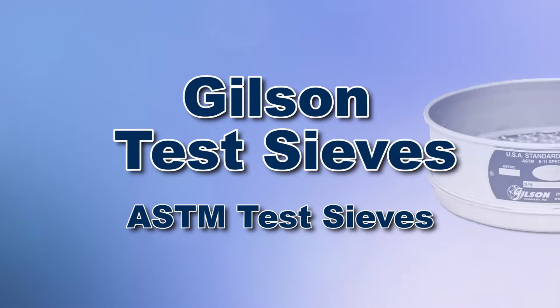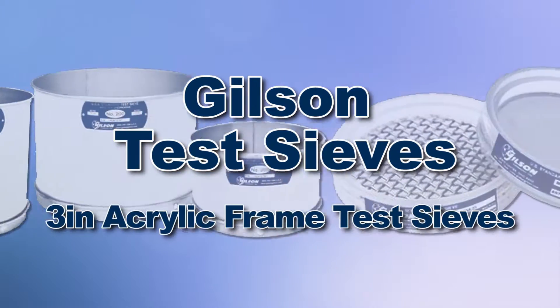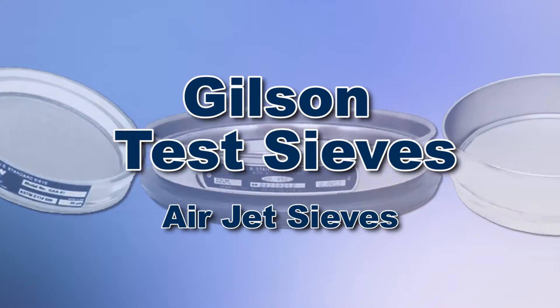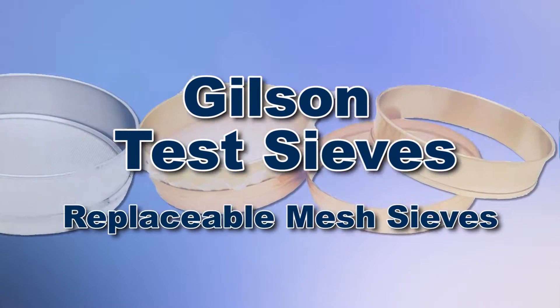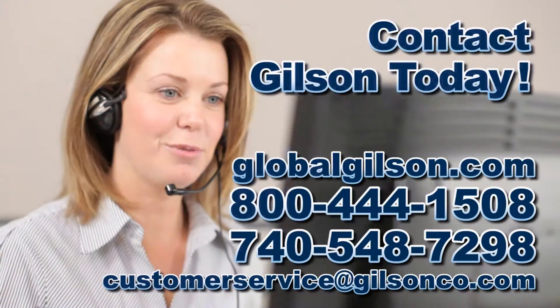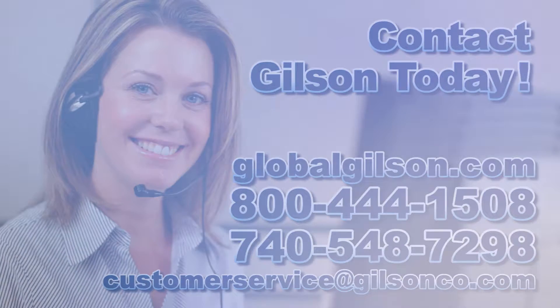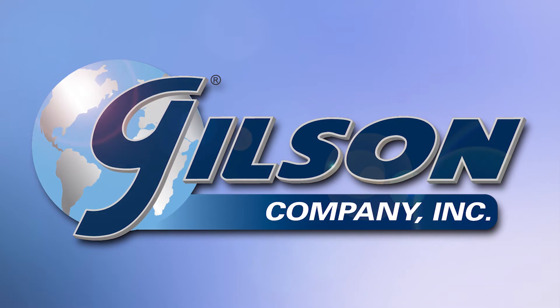With Gilson's complete family of test sieves, offering a wide range of performance features and capacities, Gilson has the right equipment for your fast, accurate and reliable sieve analysis. Be sure to check out all our sieve products and services listed in the Gilson catalog and on the Gilson website. Gilson — your industry leader in material testing equipment.